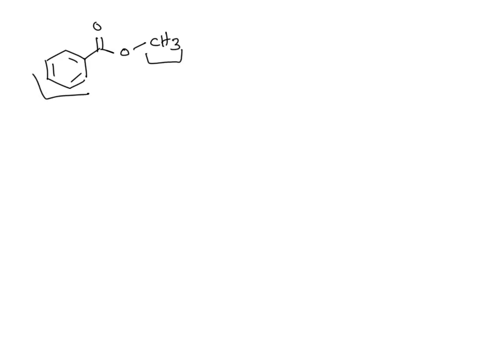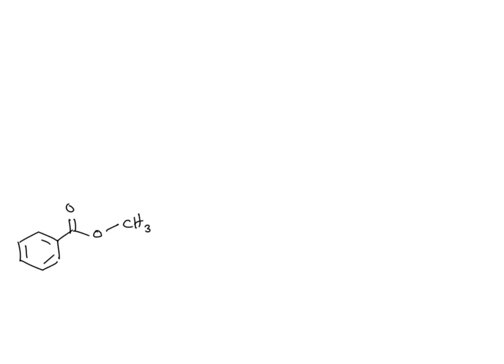Methyl benzoate, right? Now let's do the nitration on this substituted benzene. The reaction would be similar. I'm going to move this to here. Okay, this nucleophile attacks the nitronium ion that you got as a result of mixing nitric acid and sulfuric acid.